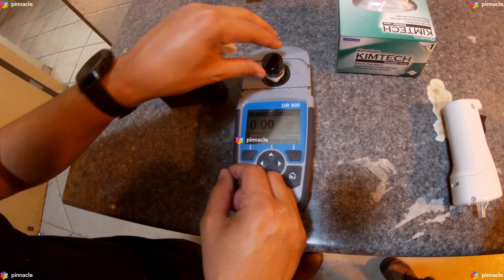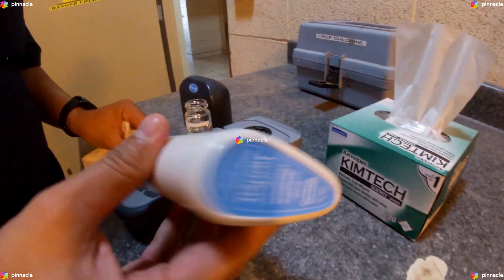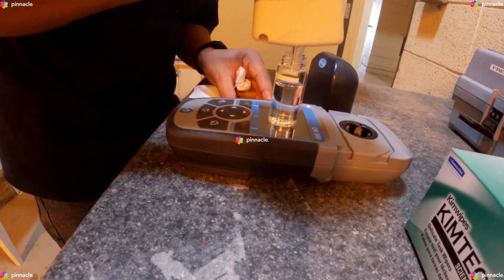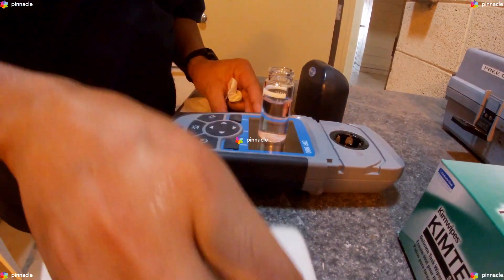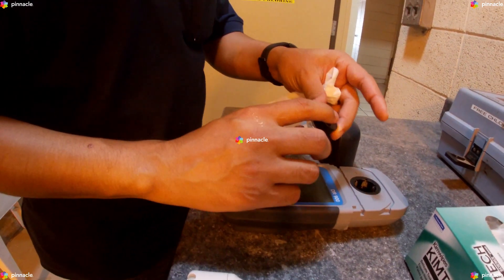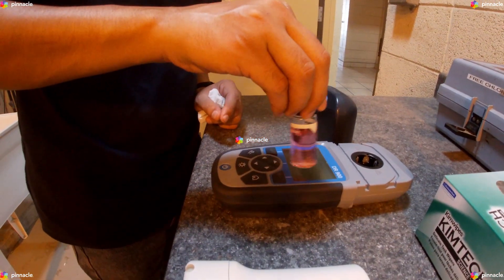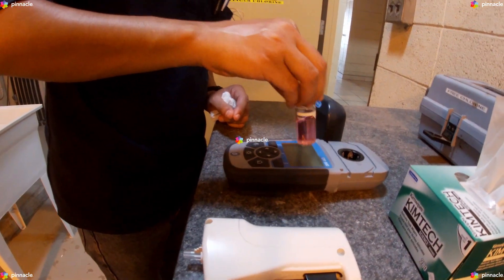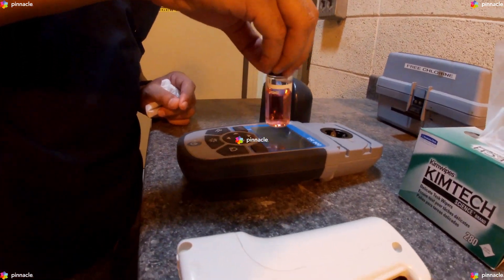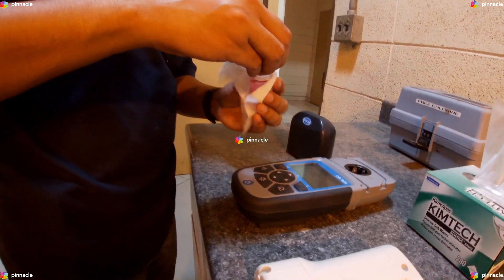We will then use our DPD free chlorine reagent dispenser and add the contents of one squeeze to the sample cell. We will then swirl the sample cell for 20 seconds. A pink color will develop if chlorine is present. We will then clean the prepared sample cell.